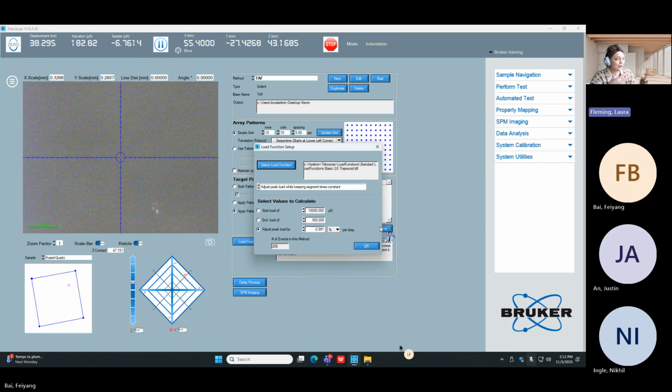That's a really large move if you're looking at your instrument. And then each indent after that is only a 5 micron move. So it makes this big move, then it comes over and basically does this. It's not moving a lot. That means that the biggest drift that we're going to see is on that first indent. Well, it's going to have the lowest percentage of error at the biggest displacement.